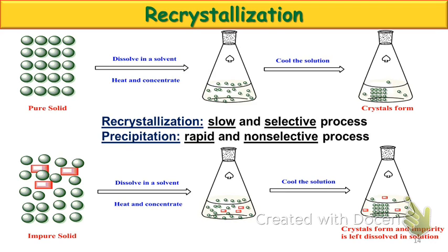We could run a melting point. So when we run the melting point, what would we expect to see? Okay, a broad range and a lower value than we would expect for our literature compound. Okay, so we run that test and we decide, yeah, sure enough, we have an impure compound. Okay, so what we're going to do is add a solvent to it. That solvent is going to go in and break all of the intermolecular forces that are holding all of those compounds together. Why do we need to break all those intermolecular forces?